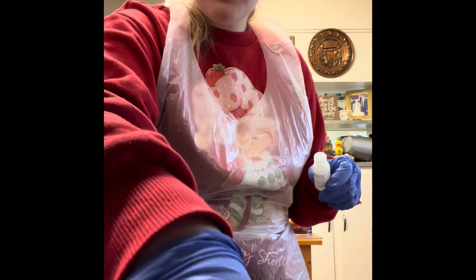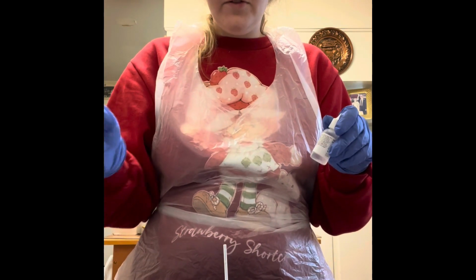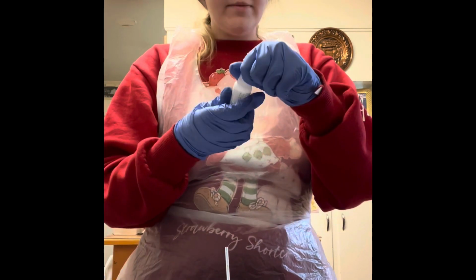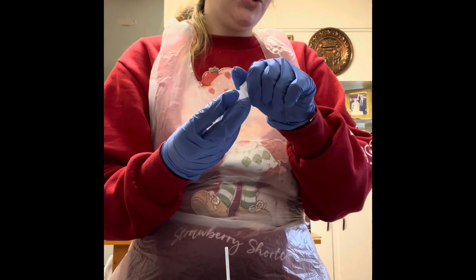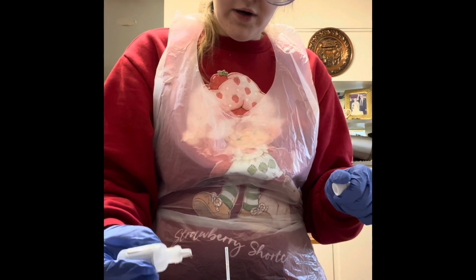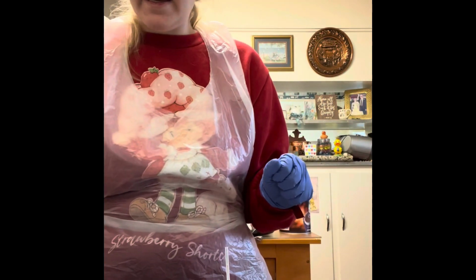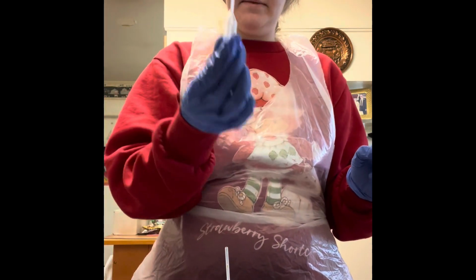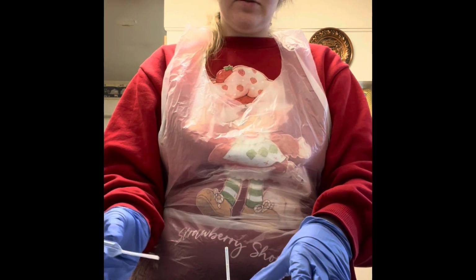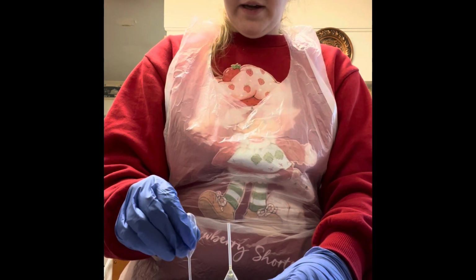So I've done my 8 drops of the potassium chromate into a separate well here. And now I'm going to go in with 4 drops of HCl. 1, 2, 3, 4. And then it says that I'm going to take an empty pipette and draw up all of the potassium chromate and HCl from the well. So let me do that.